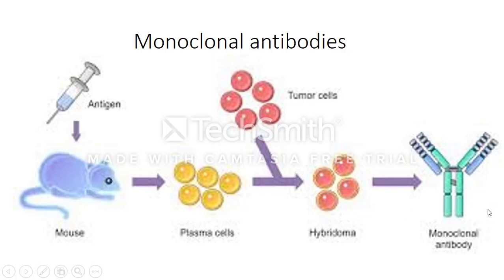I don't have a specific picture for this, but the antibody here is capable of attaching to a protein of interest, and then we have another antibody that is attached to a fluorochrome, and it attaches to this antibody, and then we can see the protein of interest.